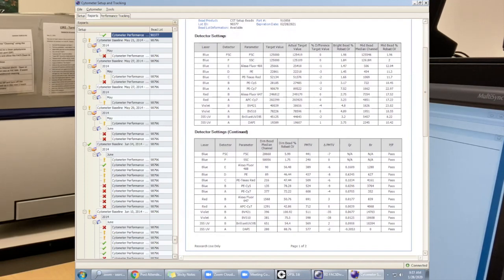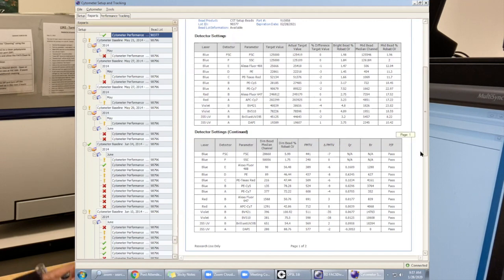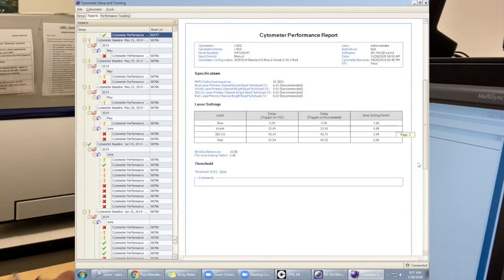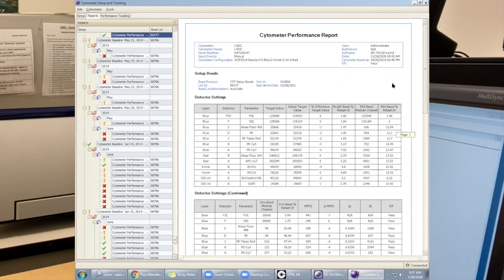Going into the delta PM TV, this is basically just showing you where the machine is performing at right now compared to when we created the baseline. So these numbers are all fairly good.